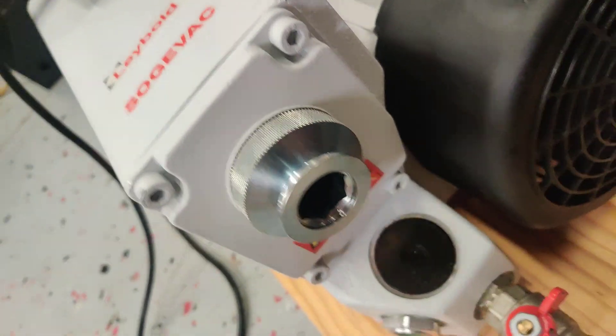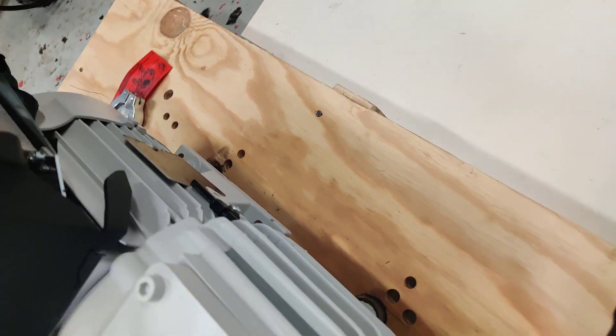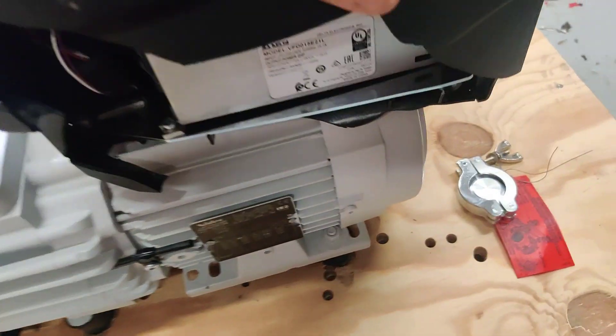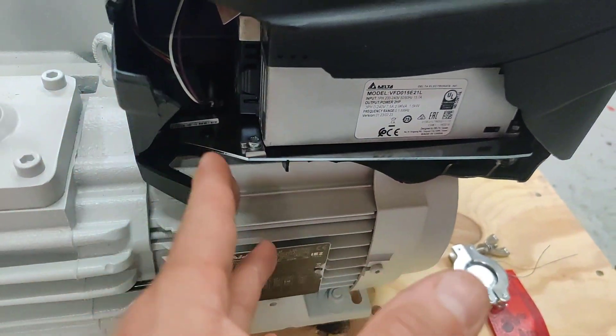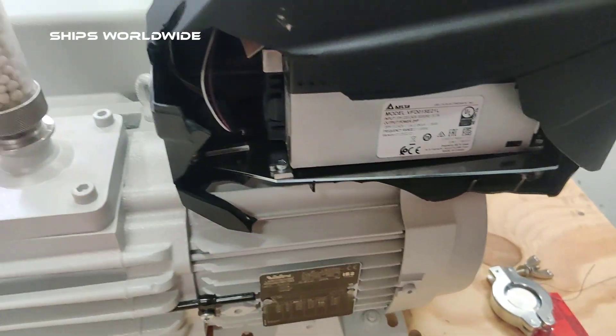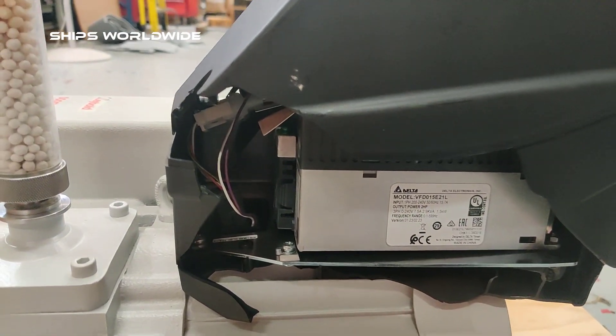It's looking very nice. The only problem is a cosmetic problem. Here you see they broke the plastic casing in transportation. So that's the only problem it has.